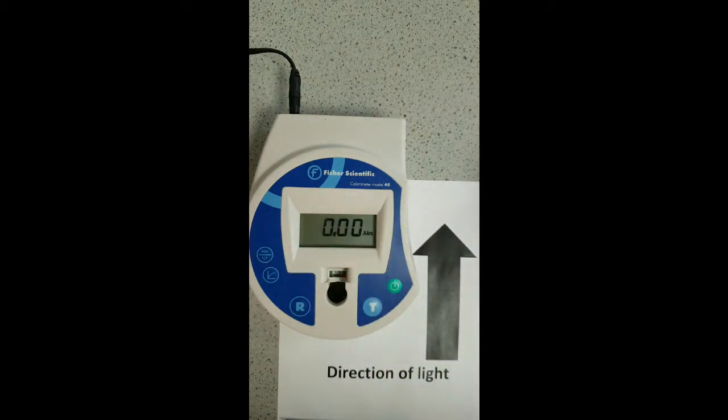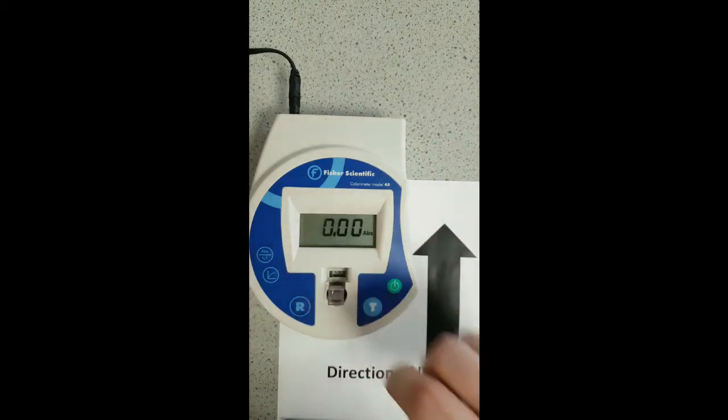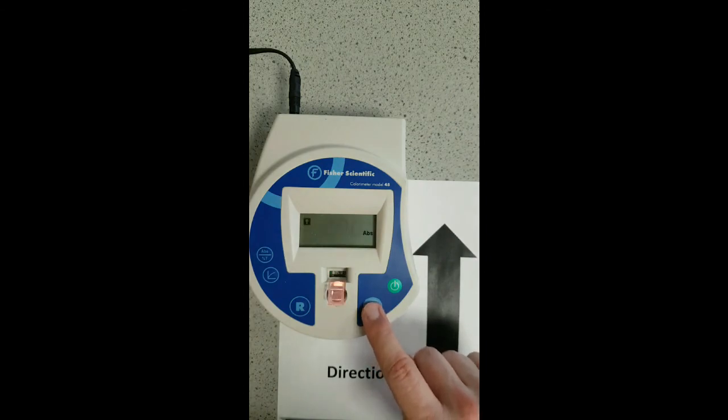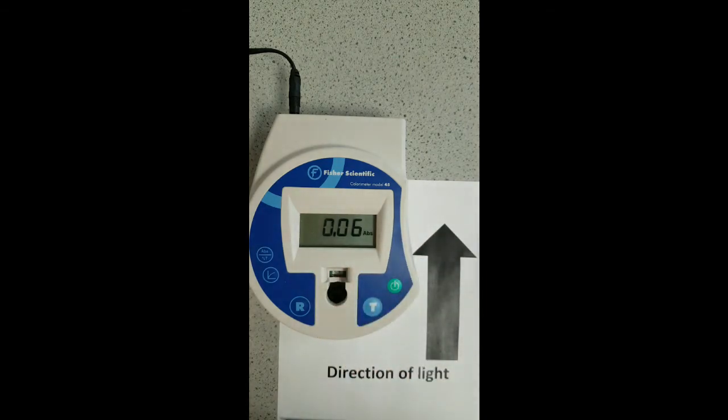Remove your cuvette with the blank or reference sample in there. Let's look at our first calibration standard. In this case we press T for test. That gives us an absorbance value for that particular wavelength in that particular sample. Make a note of that in an appropriate table, and then continue to run the rest of your calibration standards.